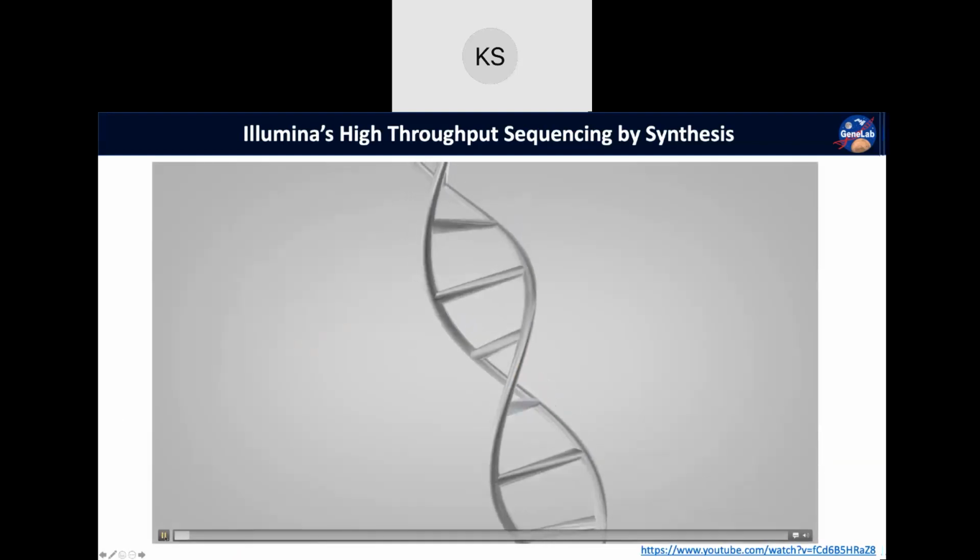The Illumina sequencing workflow. I just want to pause. Can everyone hear it? Let me know.